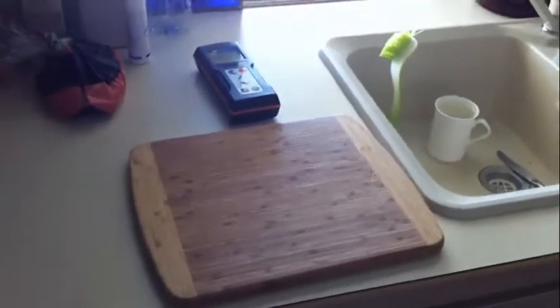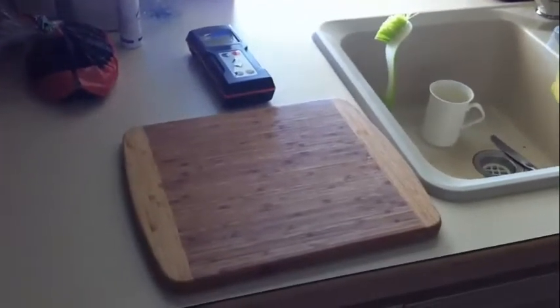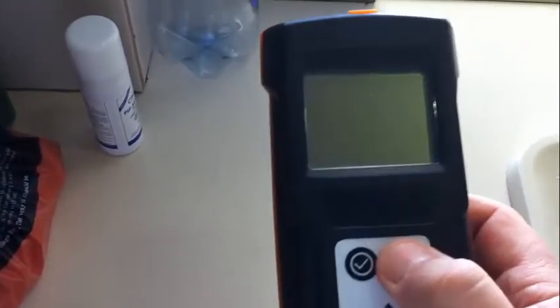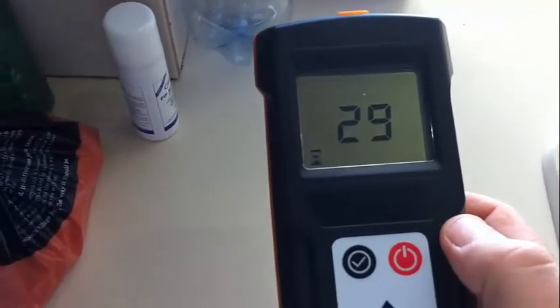Here we are, we're going to do a quick test showing the use of the ATP meter. This is the typical ATP meter. Switch it on — there we go — it runs for about 30 seconds.